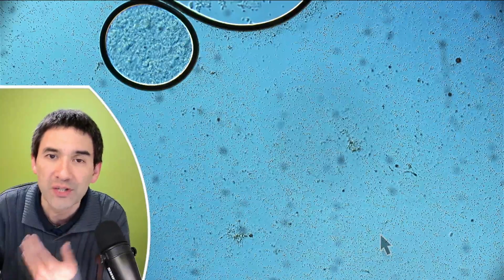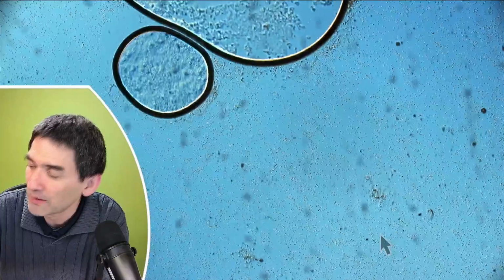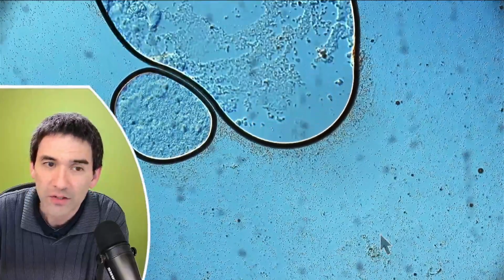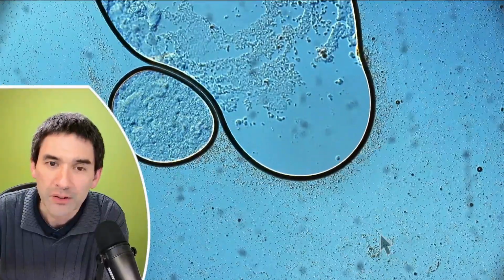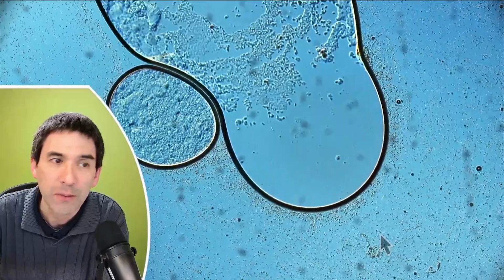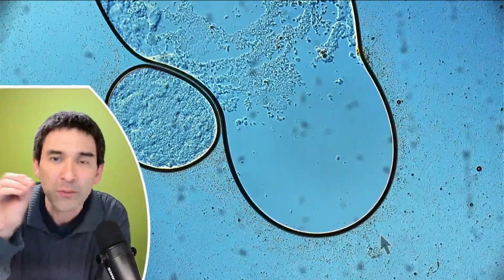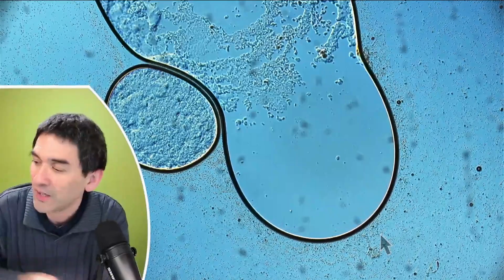And this should also induce again a directional movement. So I'm just going to touch with some tissue paper the edge of the cover glass. Of course, you see the air bubble also increasing in size, pushing the particles away. And you see then there's also a streaming motion going on. But at this low magnification, of course, we do not see the movement of the individual cells, the vibration, the Brownian motion quite well. So we have to go up a little bit.